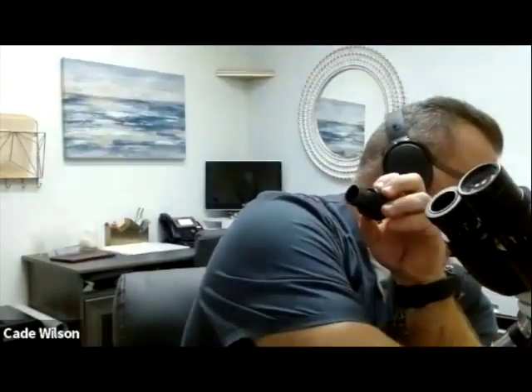You know, you can take a normal ruler, I have to try to get that close by, and just measure how big that is. It's going to go into the microscope. Like I said, most microscopes are 23 millimeters. There's a lot that are 30. There's going to be a lot bigger.